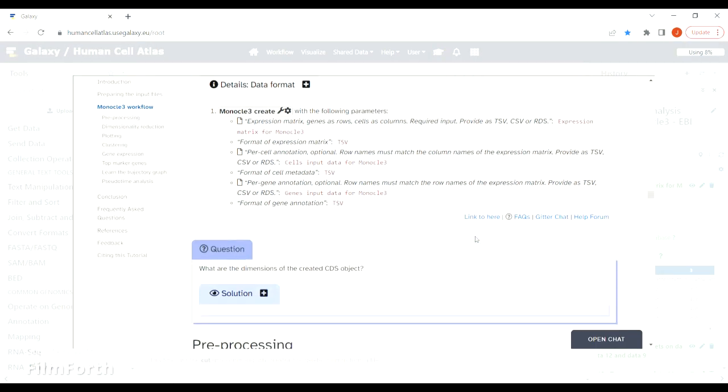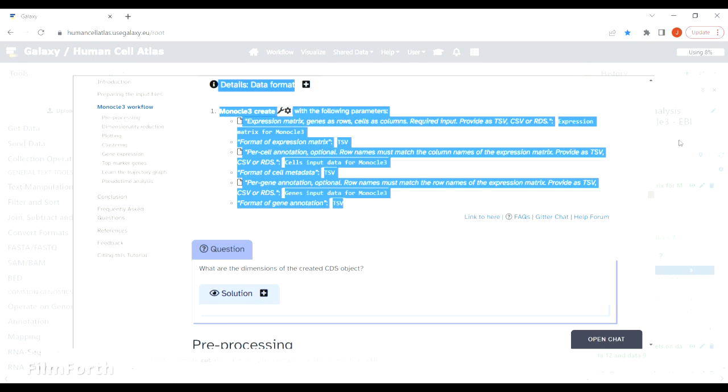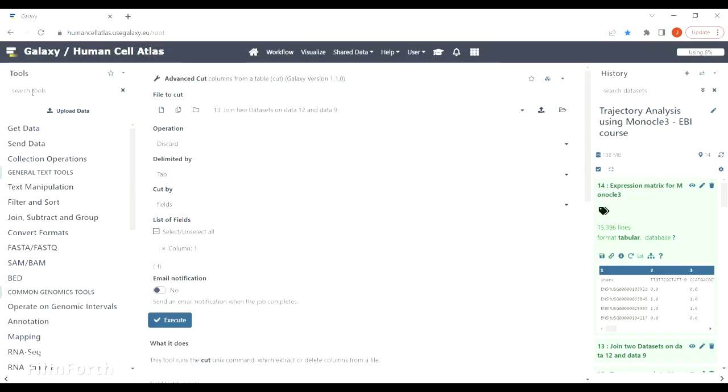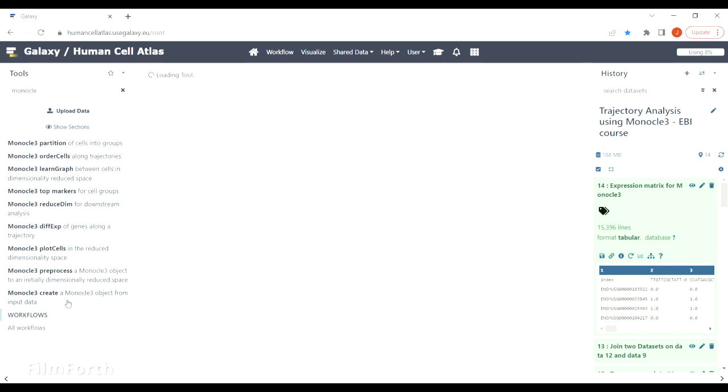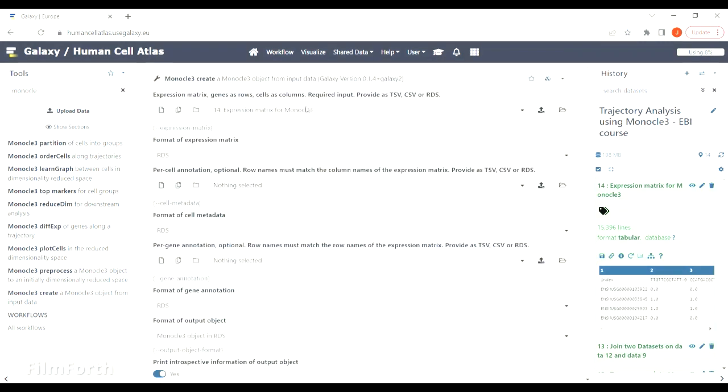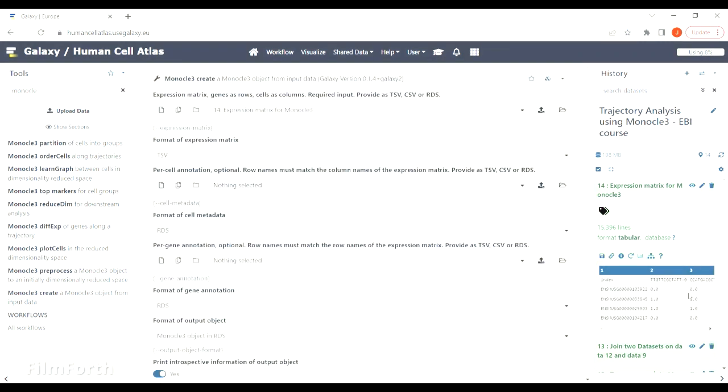The workflow is quite straightforward and we will start with Monocle 3 create tool. Now finally you can use those files that you have been preparing all that time.